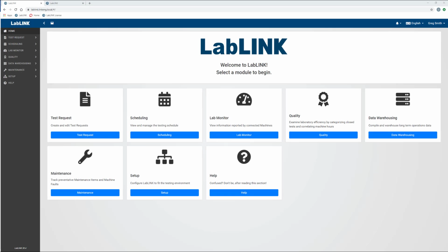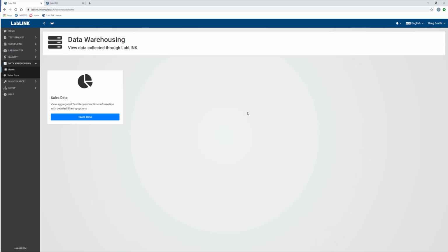In this video, we are going to cover the data warehousing module. To start, I'm going to click here on the data warehousing module. And inside, we're going to land on the home page here. Next year, we will see additional components added to this module. For this video, I will review the current capabilities.